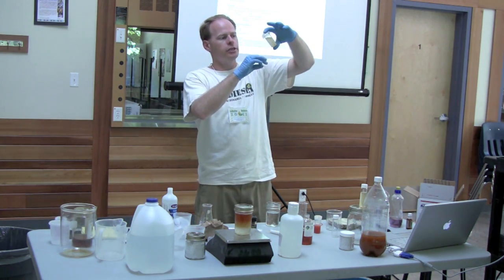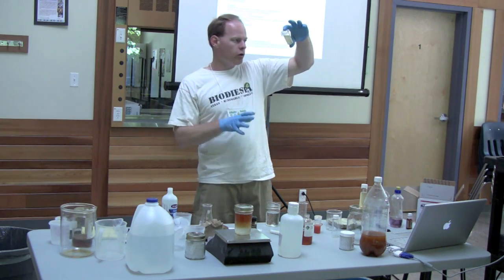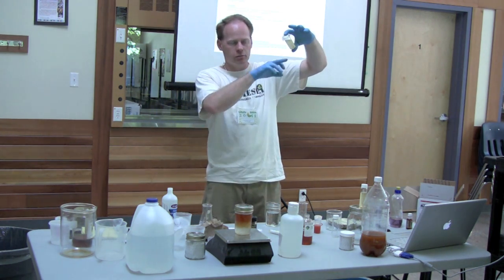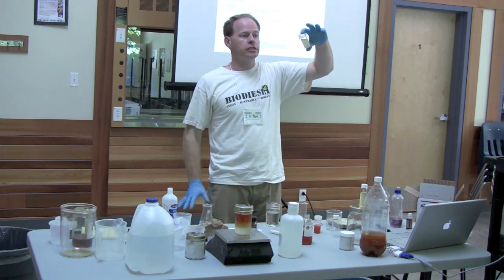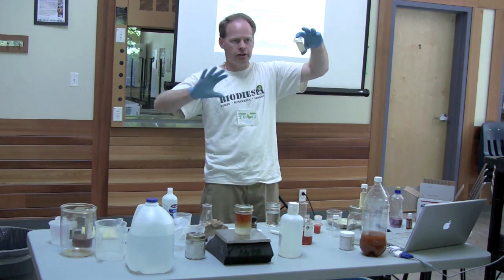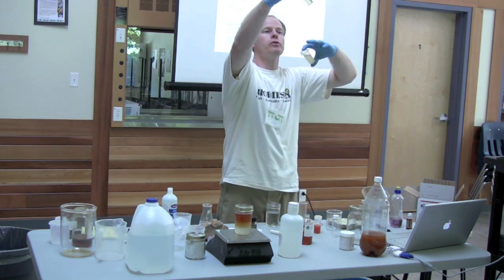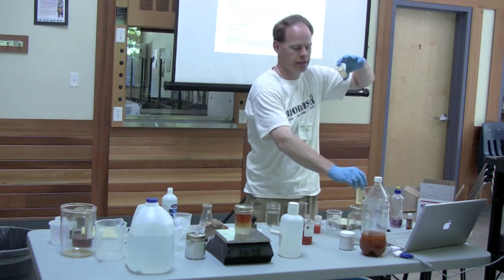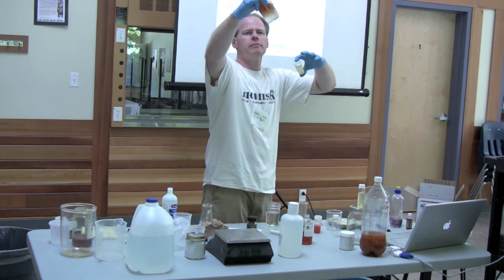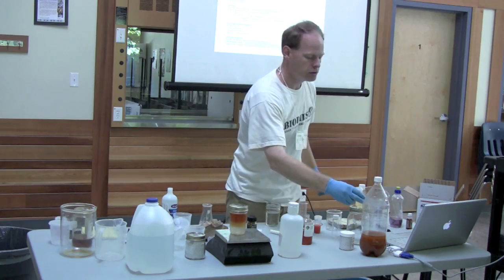If you are under 0 to 1/8 of an inch, it depends on what you're going to do. If you're burning your own fuel and you're okay with the fact that you might have a slight underreaction in there, go ahead and burn it. But if you're selling it, or if you're going to give it to someone to put in their truck, you sure as heck want your fuel not to pool at all, because that indicates you've absolutely got all the stuff out. And you want to do this shake 'em up test, and make sure that the water has turned absolutely crystal clear. Those are the quick tests.